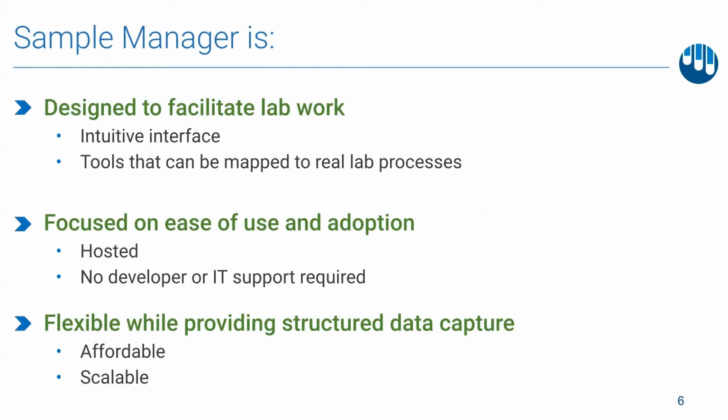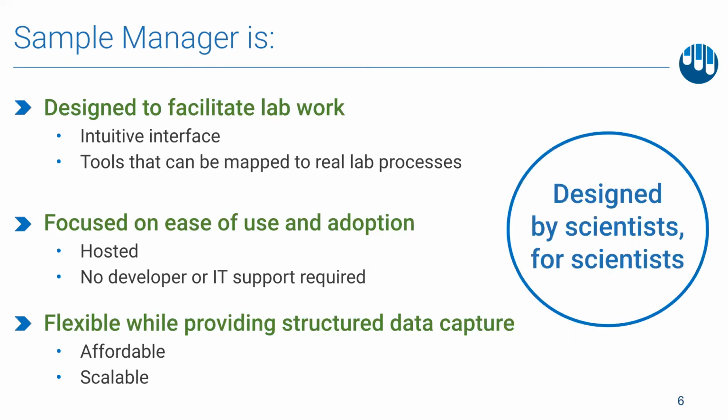LabKey Sample Manager is a cloud-based, built-to-purpose product designed to bring greater efficiency to sample processing while providing a unified view of your samples and data. To make the best product possible that was broadly applicable across scientific disciplines, we created a Sample Manager Product Advisory Council to help guide our decisions. Over a year later, these scientists continue to be highly engaged and provide sincere, valuable feedback about both the current functionality as well as upcoming features.